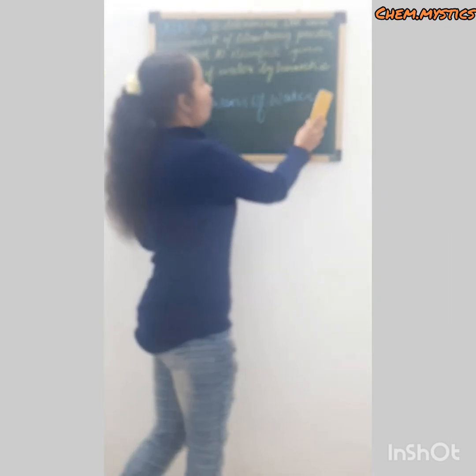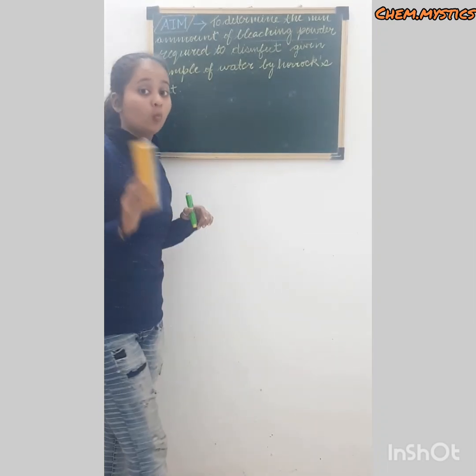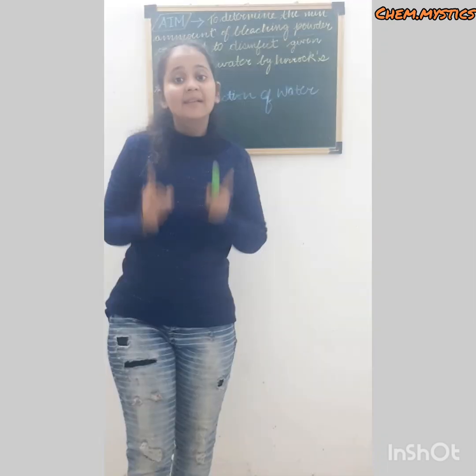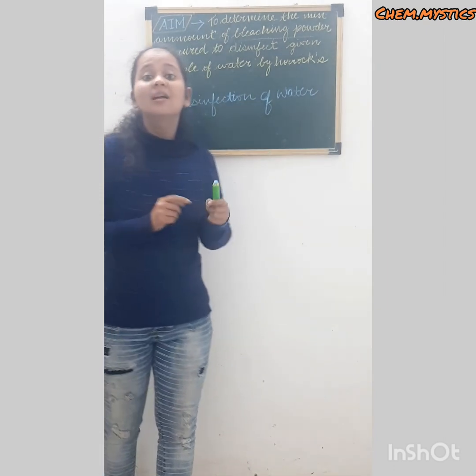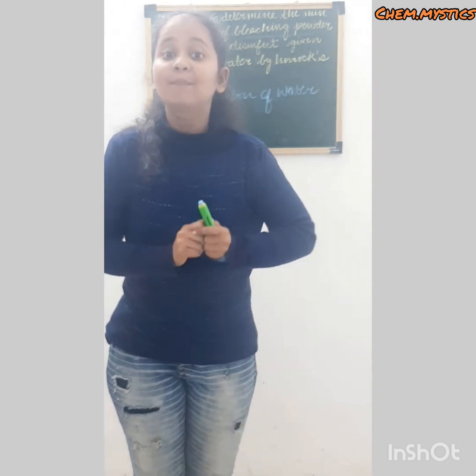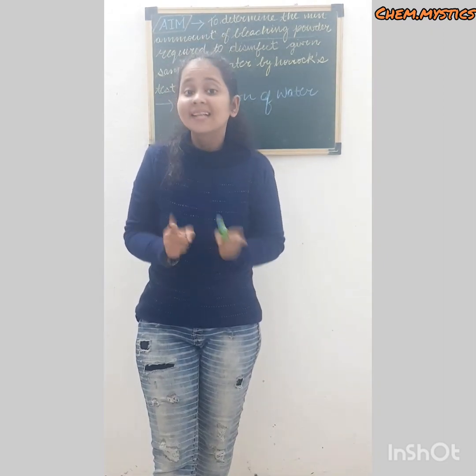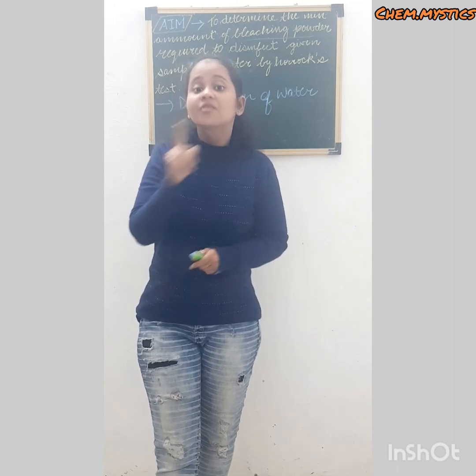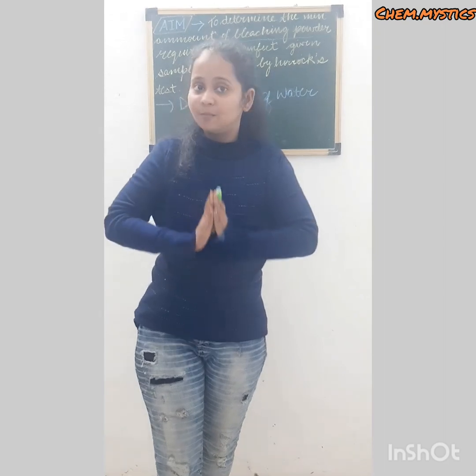Now, let me tell you something about disinfection of water. What does disinfection of water actually mean? Let me tell you, guys, that disinfection of water is basically a process in which all the pathogenic microorganisms are killed by the addition of a disinfectant. But the question to be asked is why this disinfection of water is important.